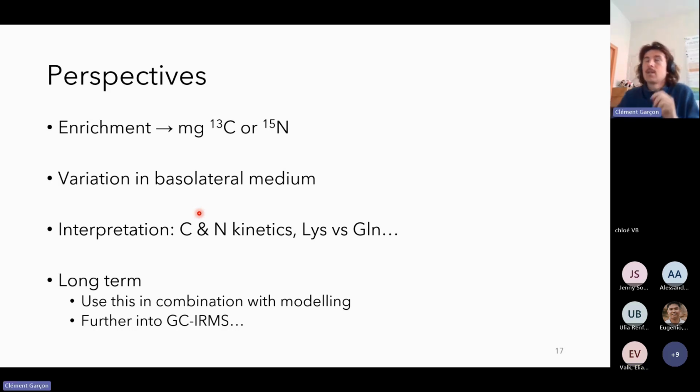We didn't do it yet, but there are some means, like you can block active transporters with certain molecules and then look at what goes through. That would be an idea. It's not something we have done, but I know that it's possible to block the transporters and then discriminate a bit between the active and passive at least. But yeah, it's not something we have done, and I don't know if we'll have time to do it.